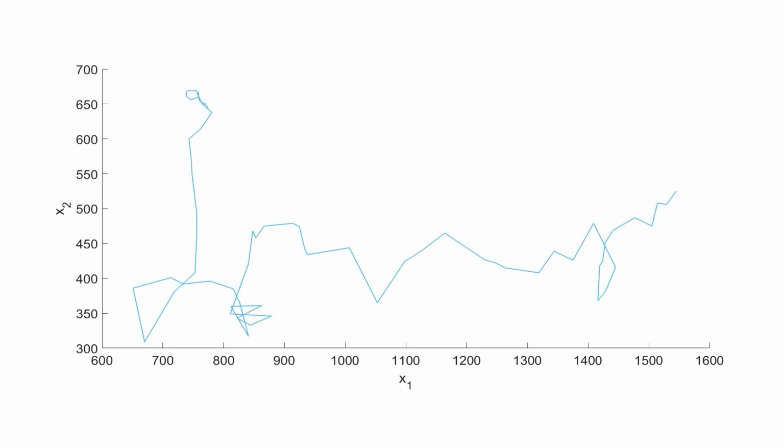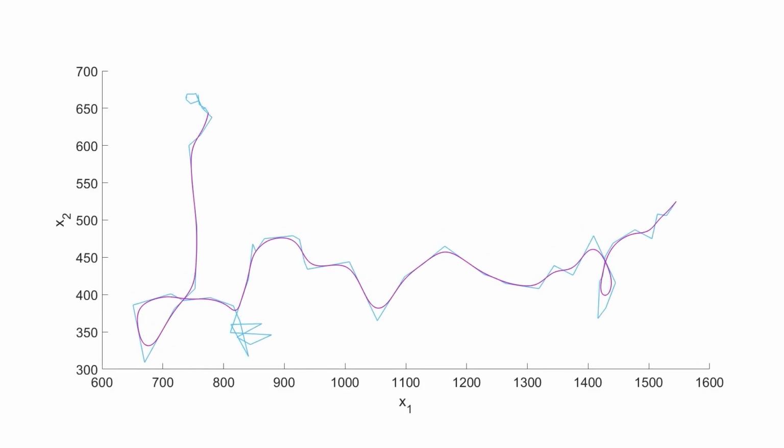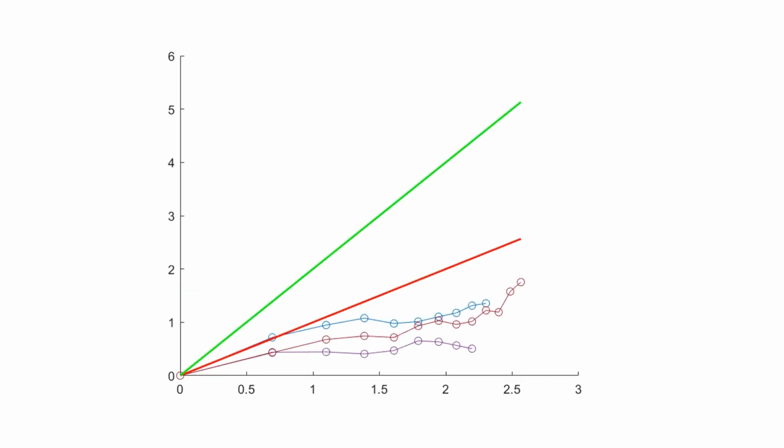Applying the formula for the length of the segments, a segment can disappear. This occurs when the segment is in a region of high curvature, that is, in a random region. Thanks to the smoothing, we can also detect the random parts of the trajectories. A random part is defined as a region where many adjacent segments have disappeared. You can see in the picture the result of the algorithm. Once the random parts have been extracted, we can study their behavior as stochastic processes.